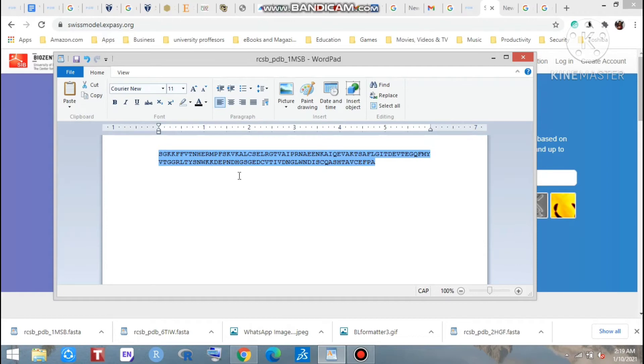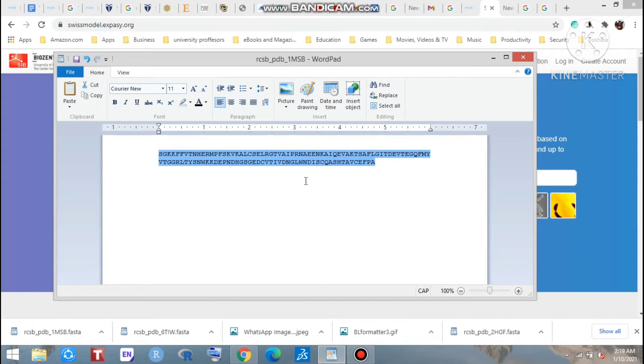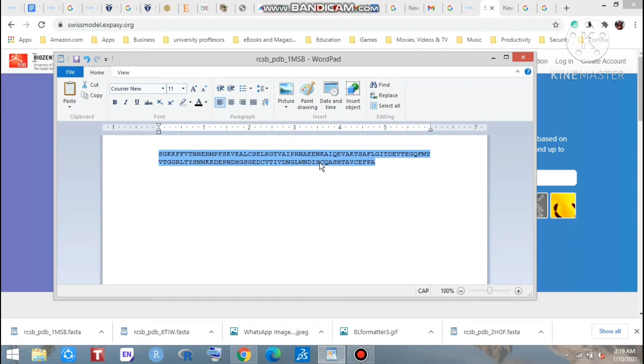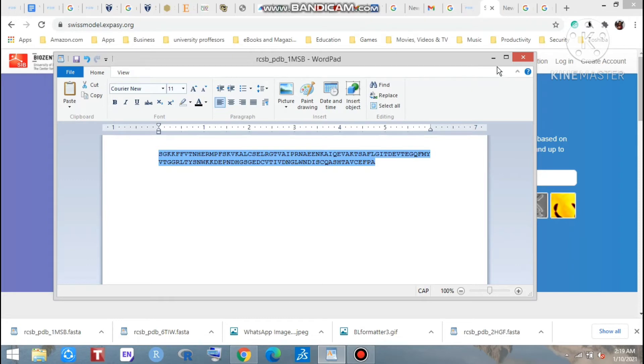You can get this sequence from so many data banks - protein data banks, RCSB protein data bank. You can download this sequence as a FASTA format. So what I will do and how to build a 3D structure of this sequence, today we are going to learn this.